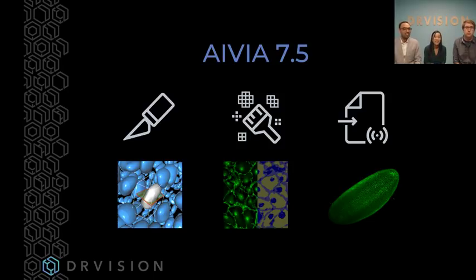All right, so we did have a couple of questions come in, so I'll pose these to both Luciano and Mike here. So the first is for the pixel classifier and training it in 3D. Can we do different planes? Let's say the XZ or the YZ instead of just the XY plane.